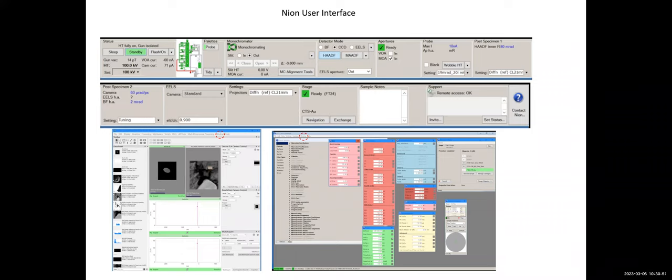They are not so precise to restore to the exact same mechanical status. Okay, let's continue the window. So this window where I'm circling using my mouse is called tuning parameter. It is a panel defining how you want to control the parameters used for the automatic aberration measurement.